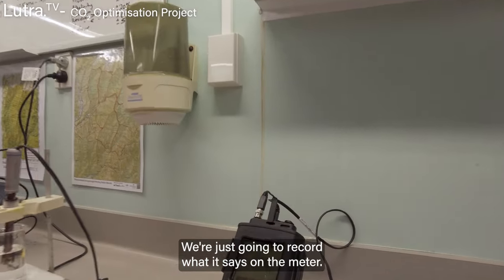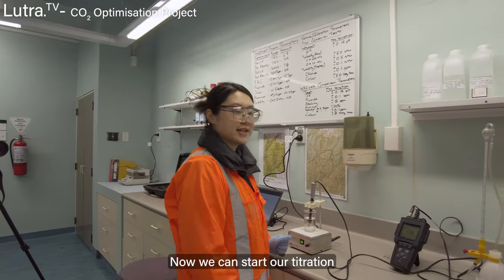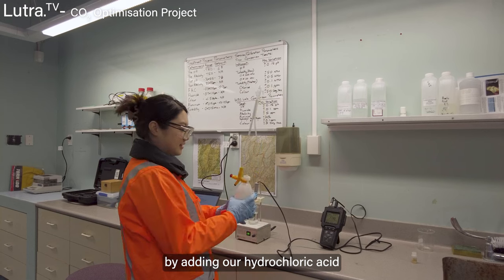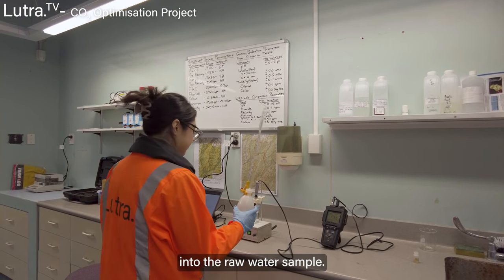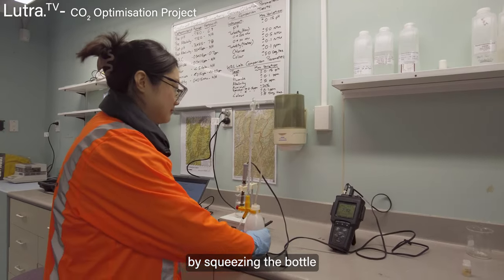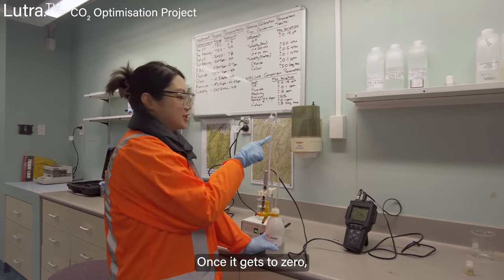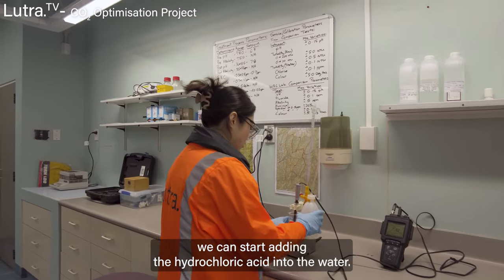We're just going to record what it says on the meter. Now we can start our titration by adding hydrochloric acid into the raw water sample. First I need to zero the burette by squeezing the bottle. Once it reaches zero we can start adding the hydrochloric acid into the raw water.